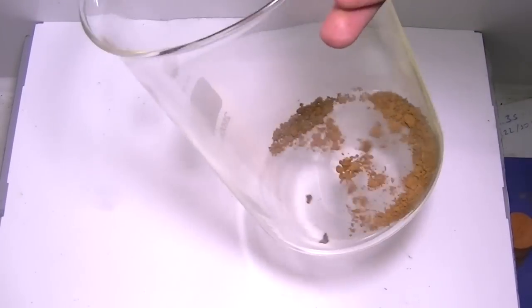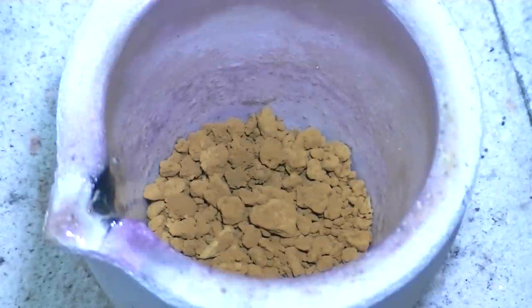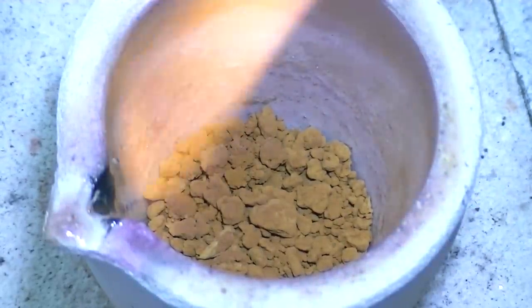And here it is — dry gold powder, ready for meltdown. The gold is clean, the crucible is ready. Let's fire it up.